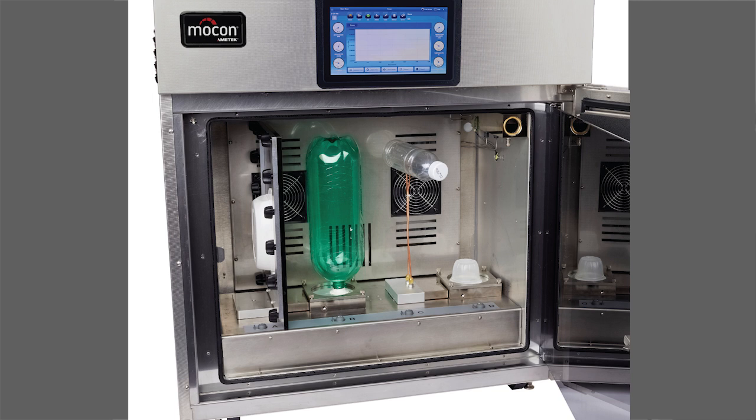And that can be a very important measurement because these bottles, these packages of different types, are usually very repeatable. They've got good material thickness, good distribution, good crystallinity. That all can be characterized on it.